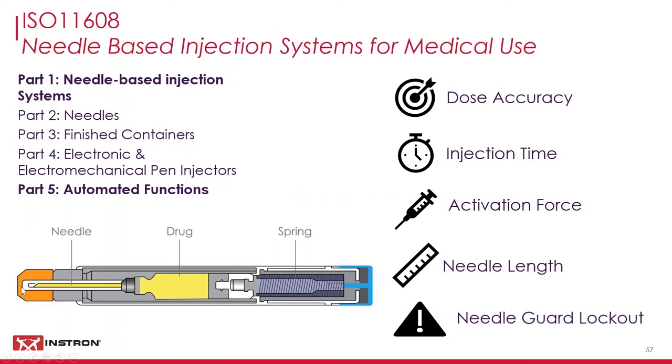During development and production of these devices, testing generally combines governmentally regulated standards along with internal quality tests. ISO 11608 for needle-based injection systems is the most widely used international standard. Part 1 and 5 are the most applicable sections of the standard for the testing of auto-injectors and pen injectors.